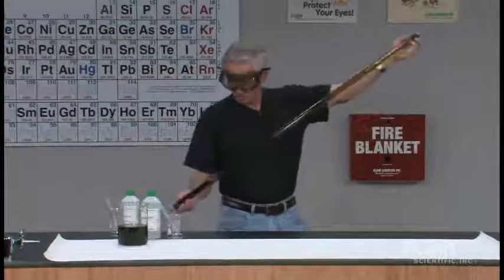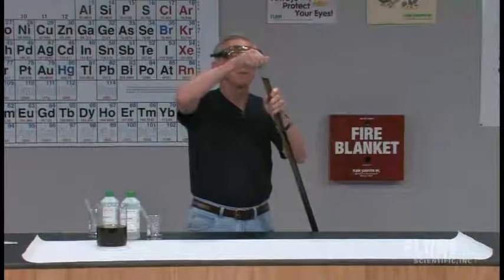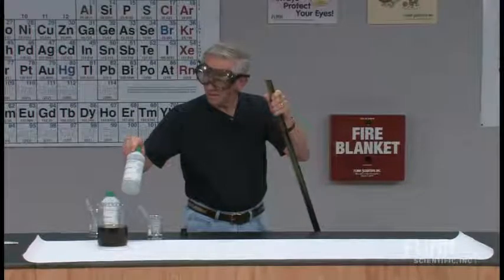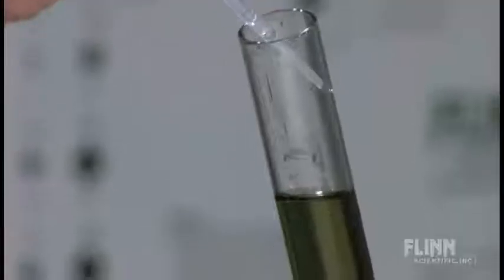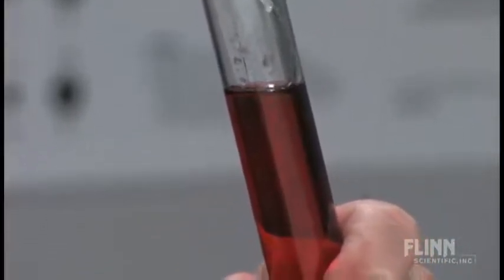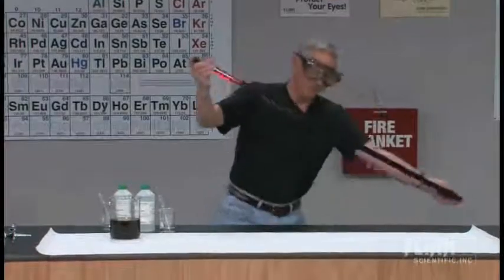I'm going to turn the tube over and put it back on my table. Now I'm going to have some 3 molar hydrochloric acid that I'm going to put in this end. Notice that I'm carefully measuring the amount I use.